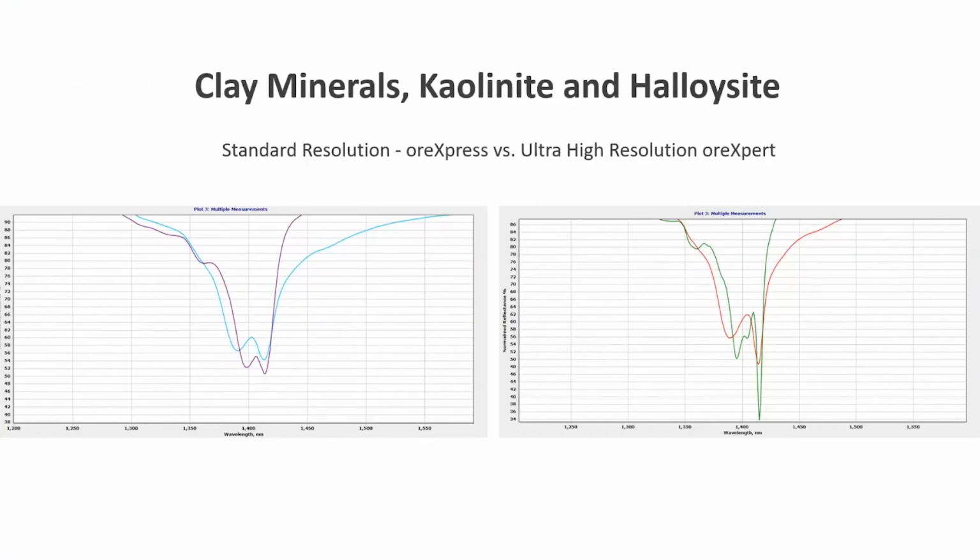Now you can see this with the oreXpress versus the NaturSpec Ultra, or the ultra high resolution expert, sorry, oreXpert. So here you can see halloysite on the left.